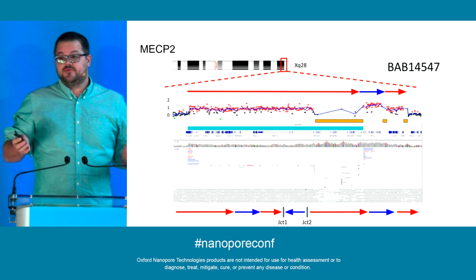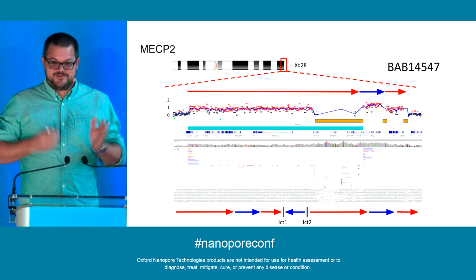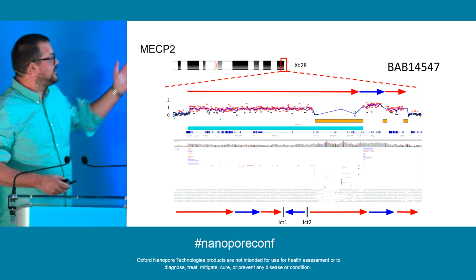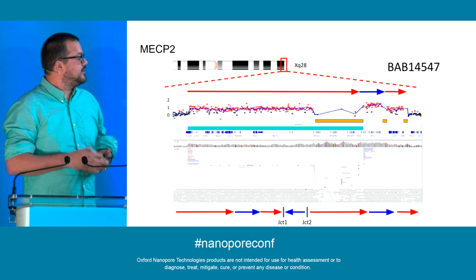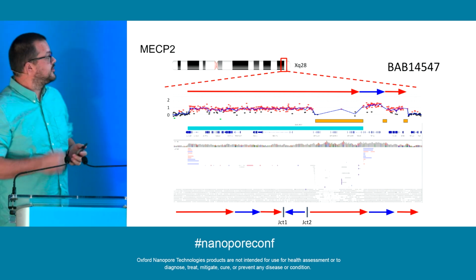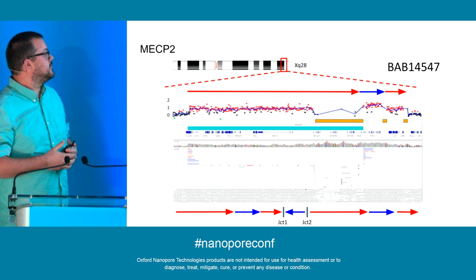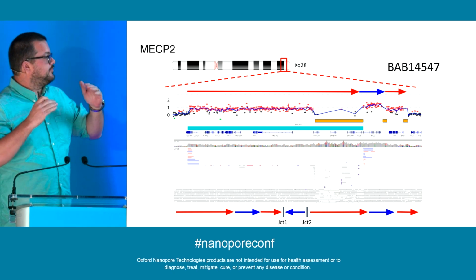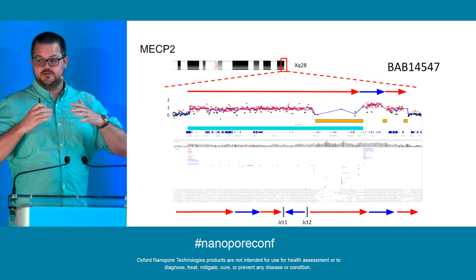There are still challenges remaining, which is great because that keeps us going and keeps my job going. For example, this scenario here, where we have quite a tricky region. In orange, you see segmental duplications. On the top, you see data from a copy number array, and you see that in red, you have abnormal copies in the proband in this region.